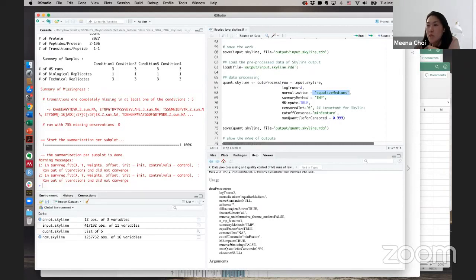For SRM, I'd like to normalize the bar, equalize the median of reference by the standard and then apply global standard. Is it possible? Currently MSstats supports only one normalization for one step. So for this one, we need some manual work in R, unfortunately. And actually this is exactly what we do for one of the biomarker studies, the MCP SRM bigger data set, the ovarian cancer data set. So probably I will put some link on how we normalize this kind of case in the Google Doc.